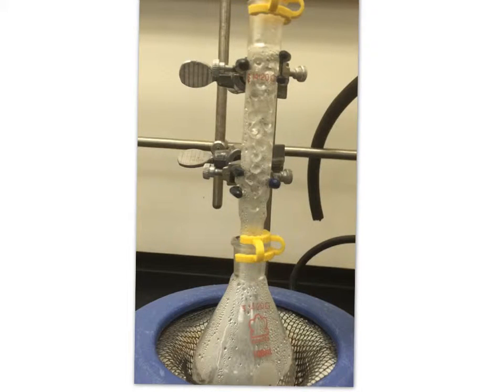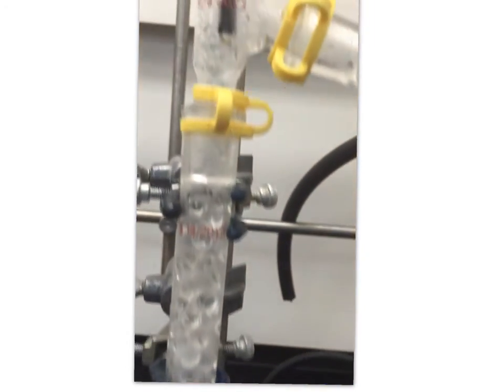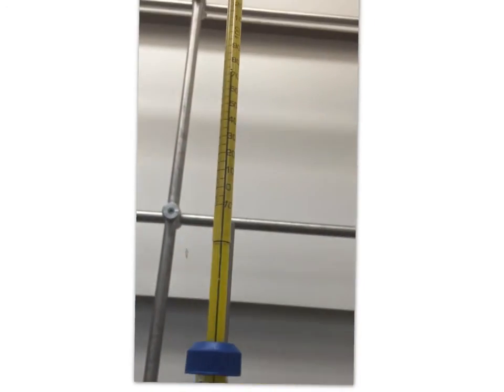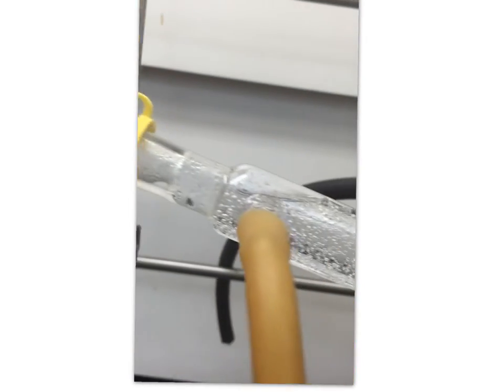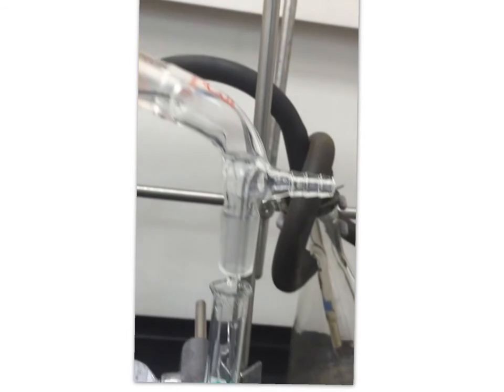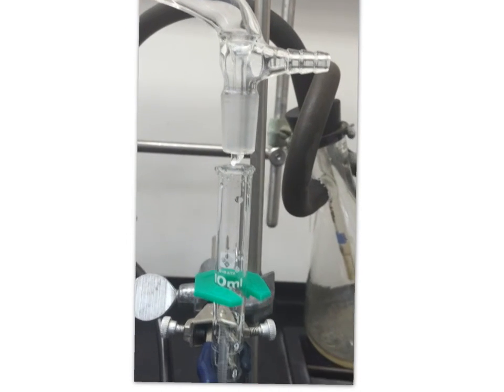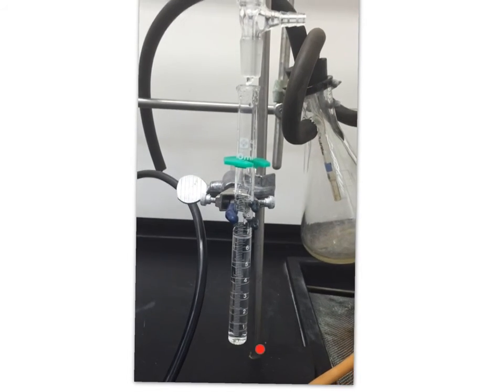As said in the previous slide, regarding the glass beads in the distillation column in the fractional distillation apparatus, the main point of using the glass beads is to allow the liquid inside to condense and evaporate and condense once again, so the liquid is distilled many times. The main theory of fractional distillation is that the more times it is distilled, the more pure it is, which is the main purpose of distillation, to separate and purify a compound.